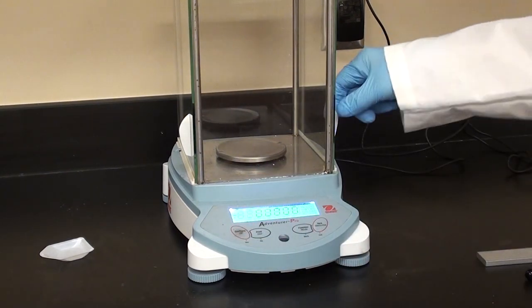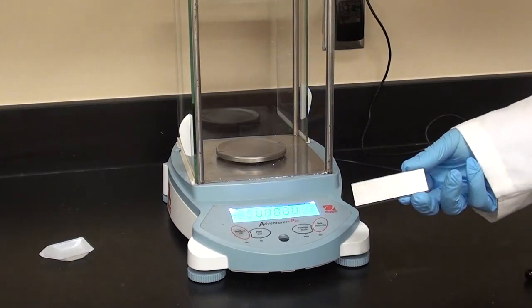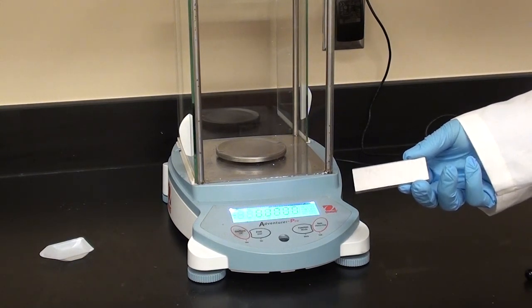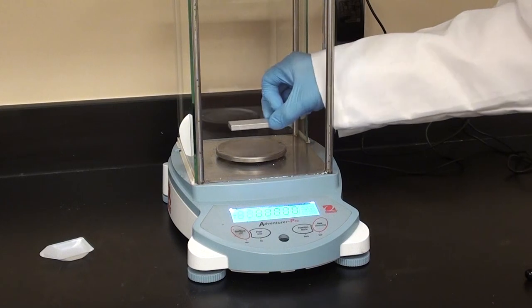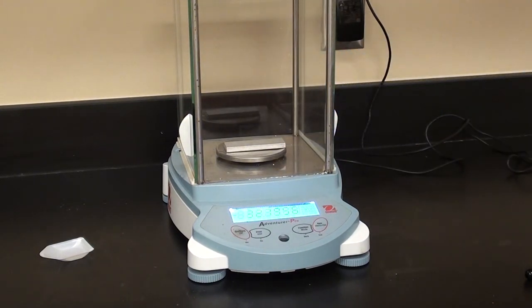Now we're going to weigh each of these. This is the aluminum block and we're also going to get a volume of this so we can get the density. We just go ahead and stick it on and then we record all the available digits off the balance. We don't estimate it, we just copy down exactly what we see there.